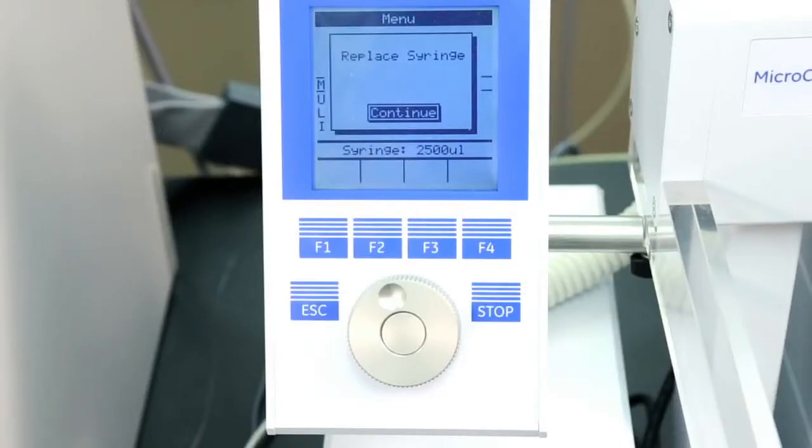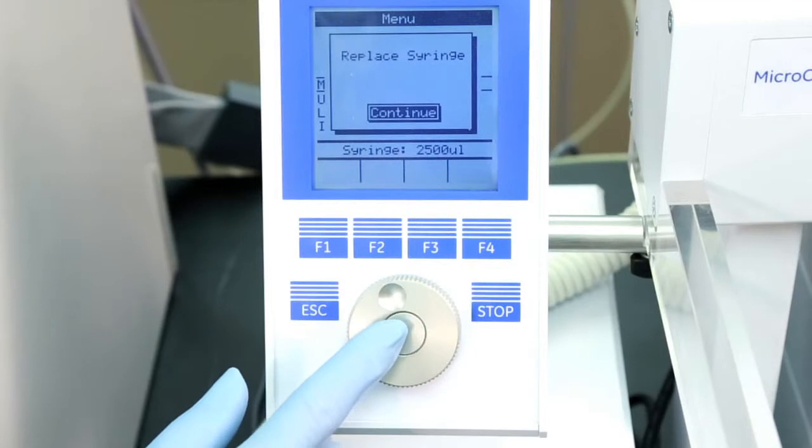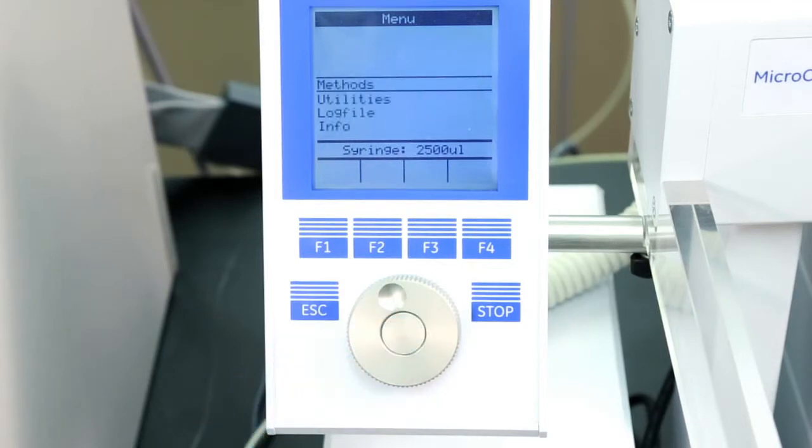After the syringe has been inserted, press the enter button on the console and then press the home button. The plunger will then move down until it hits the mechanical stop. This position is stored as the syringe's zero volume position, and then the injection unit returns to its home position.